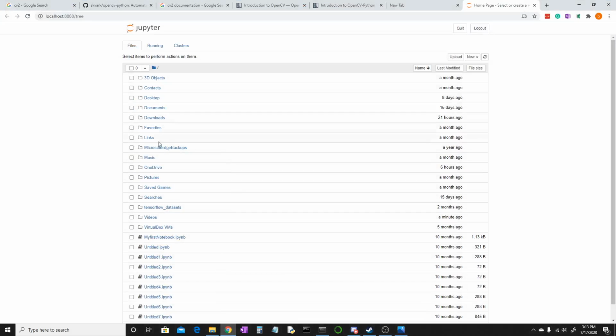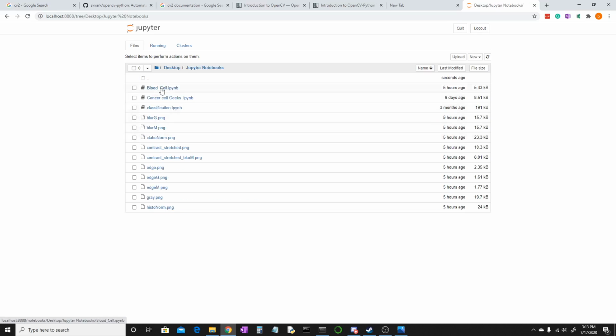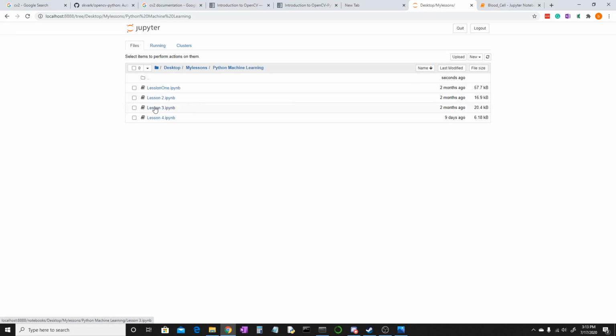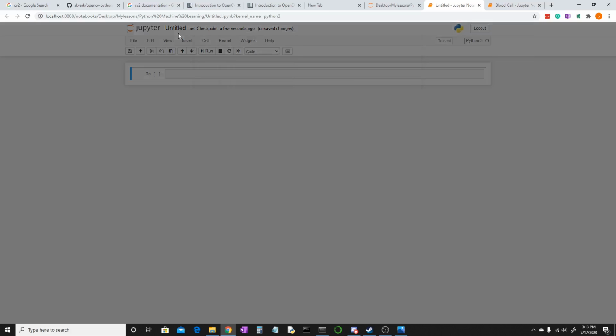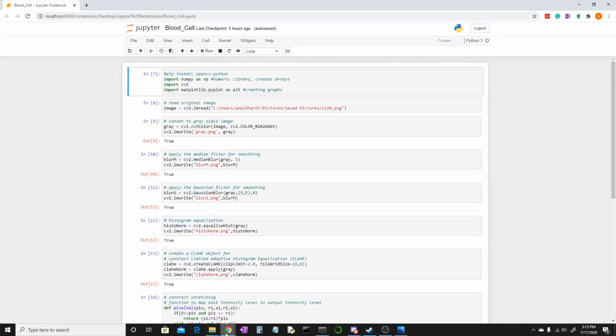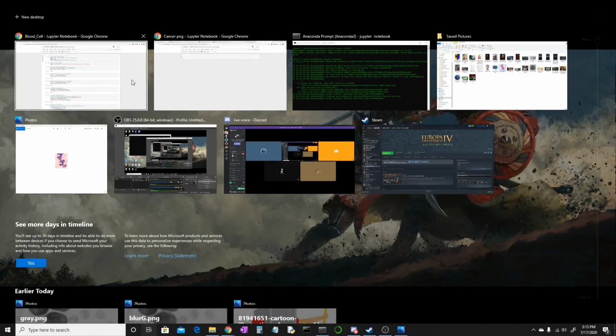Then we go back, and we're just going to create a Jupyter Notebook. Open up this one. Lessons. What do we call it? Just PNG. This is only episode 1 because we need a lot of code.